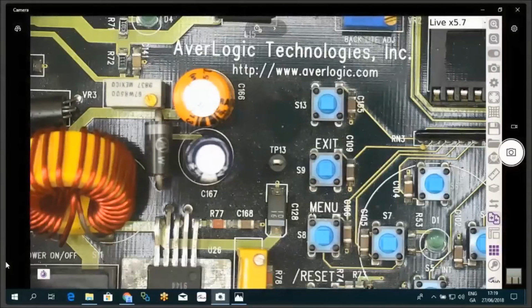So this allows operators to rapidly identify differences, which again reduces inspection time, reduces fatigue on the operator. You know, if they were using an optical system, they'd be hunched over looking into the eyepiece, and they wouldn't have this capability. So that's overlay.